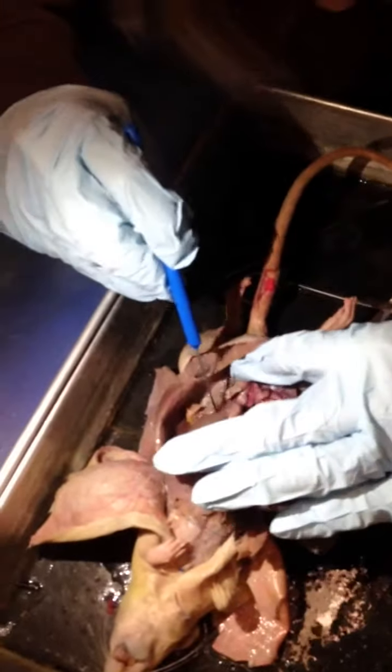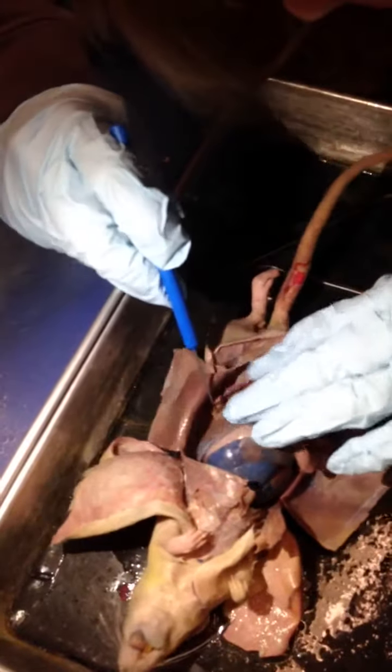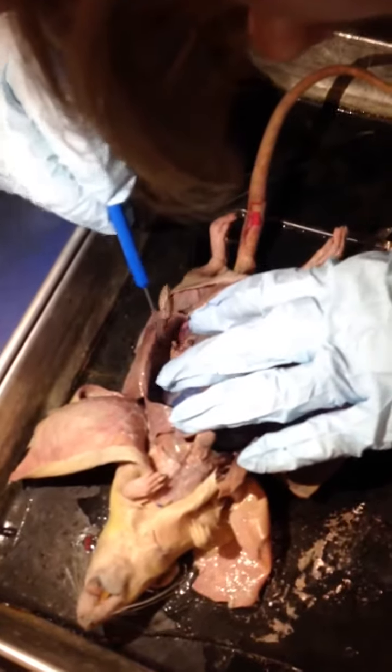Then this is just a bed of fat. And then the broad ligament is what attaches the, all this is the broad ligament. Then your, so this right here is your ovarian bursa.